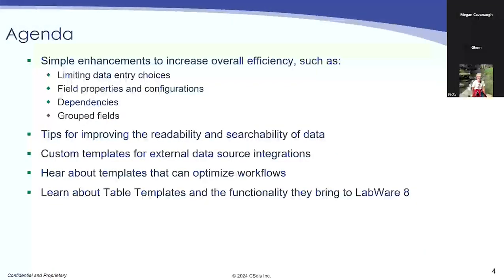So the agenda in this webinar: I'm going to go over how LabWare templates can support decision making and regulate data entry, and how performing these enhancements will flow downstream when reporting data within the department or organization. LabWare templates allow for diverse and tailored experiences and can amplify your system functionality for all users and stakeholders and ease your validation tasks as well. I'm going to talk about simple enhancements. Some of these are simple enough that a system admin can perform.